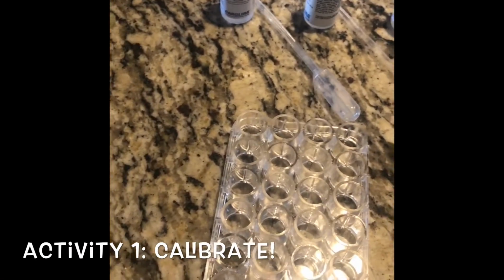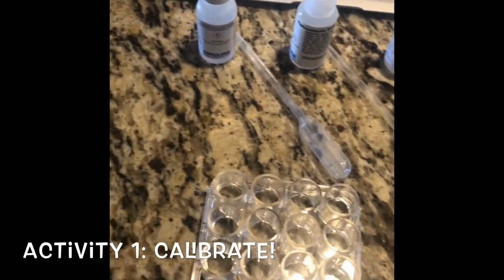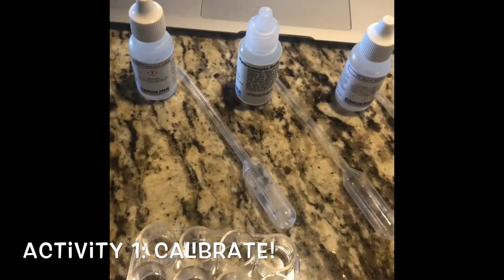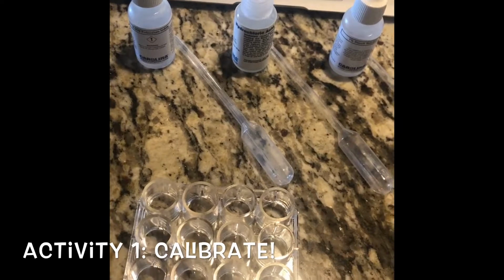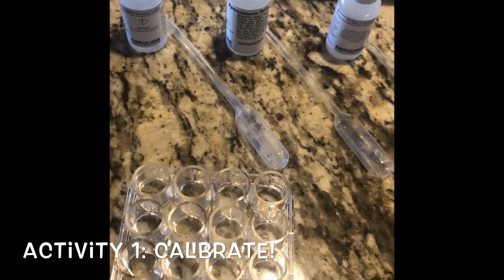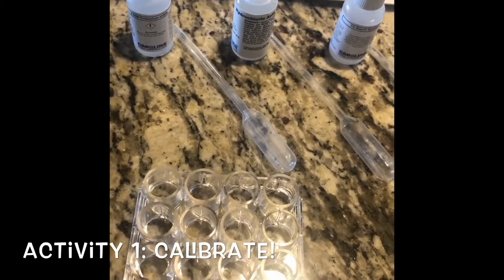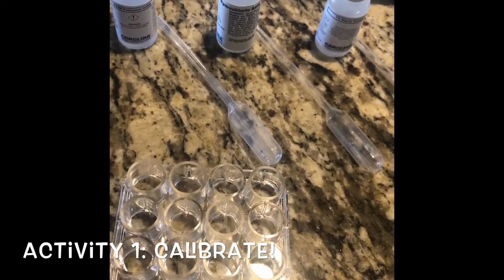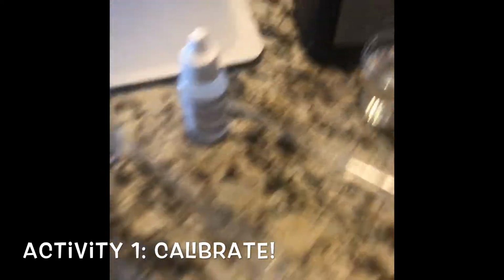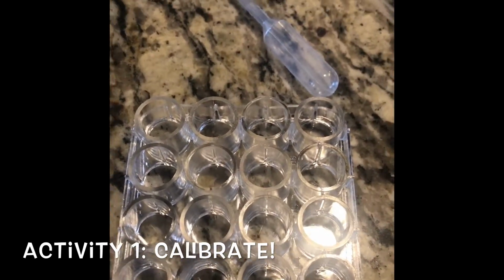Orient the plate 4 across and 6 down. In the top left, in this top one up here, we're going to place 8 drops of KI. Then we'll add 2 of HCl, 4 drops of starch, and 8 drops of sodium thiosulfate, and then we'll mix it by swirling. We will add 0.4 mL of hydrogen peroxide at 3%, and then finally we'll begin timing as we do that.